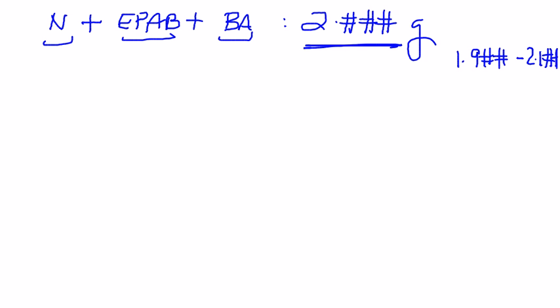Now, you're going to dissolve the 2 grams of this mixture in 20 milliliters of dichloromethane. I would very strongly recommend this should be done in the hood. You should not inhale dichloromethane.